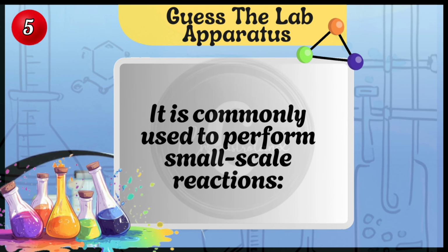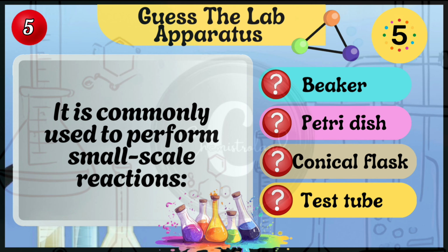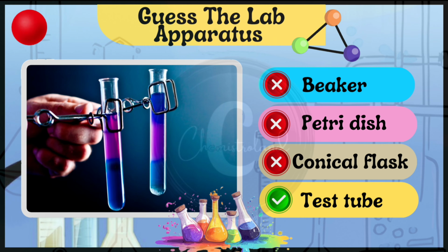It is commonly used to perform small-scale reactions. Beaker, petri dish, conical flask, or test tube. The correct answer is test tube.